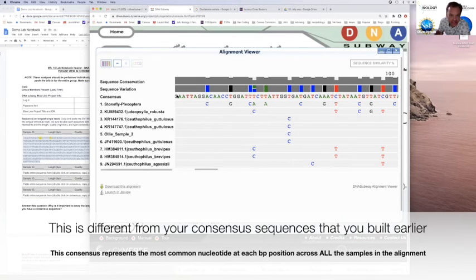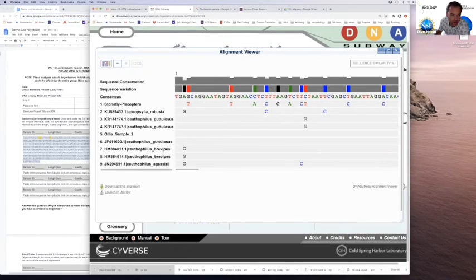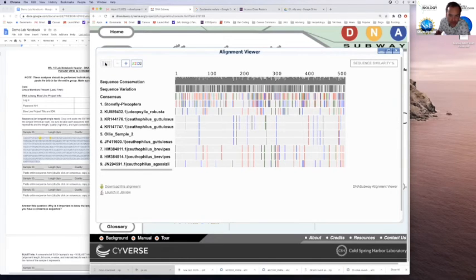And then there's this consensus sequence. All the consensus sequence tells you is what the most common nucleotide is at any particular region. You can see at this region, A is the most common one, and there's zero variation there. Anywhere the box is just light gray, it means there's no variation across all the sequences. And if I zoom back out to this barcode level, by clicking this button over here that has the barcode in the left corner, you can see all the variation that we see.